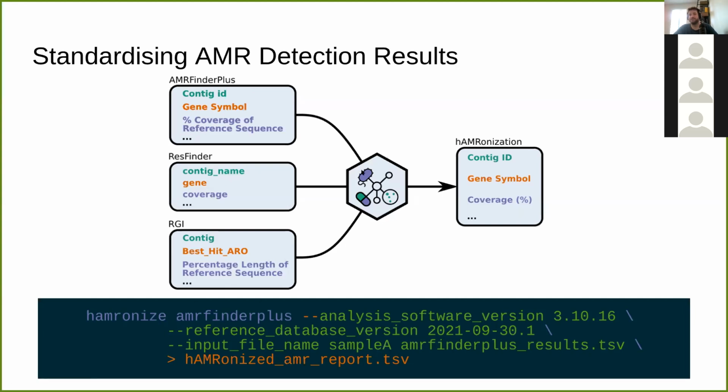So what you can use is harmonization, and again, Inês went through this in a lot more detail, to basically translate all of these different fields and different tools to one standardized set of names. There are a little bit of nuances in running it, but essentially it's again a simple command line tool. So you just harmonize the name of the tool you're wanting to run.